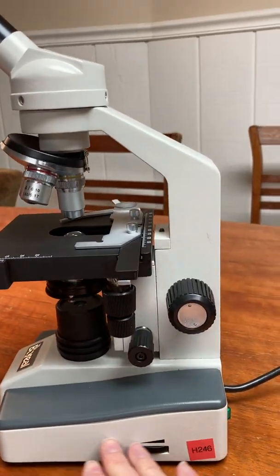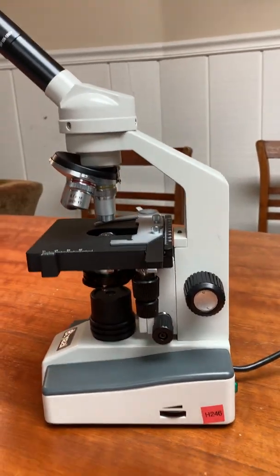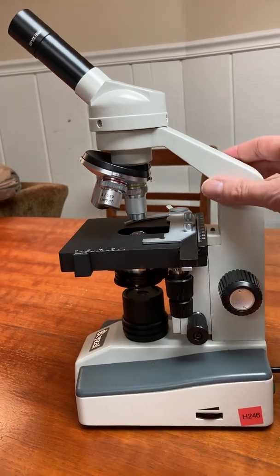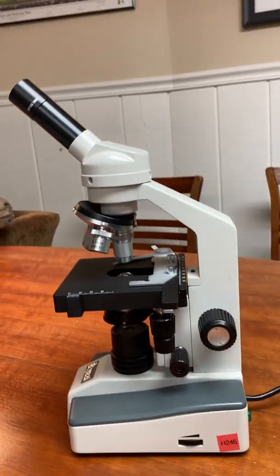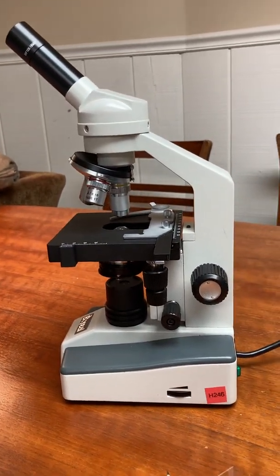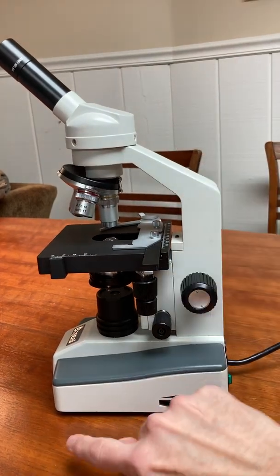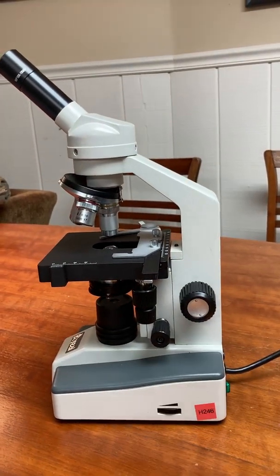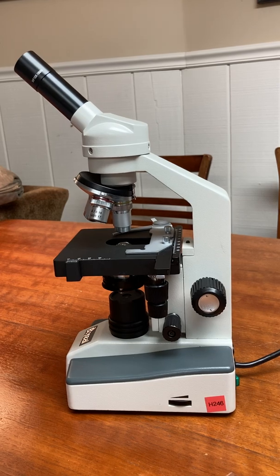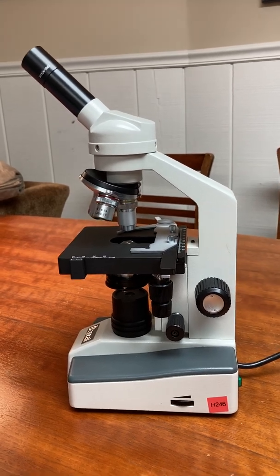First, I want to say that this is the base. It's what the microscope sits on. This is the arm. It's how you carry it and you should always carry the microscope with one hand on the arm and one hand on the base underneath because these are expensive. They're several hundred dollars each and you really don't want to drop it.